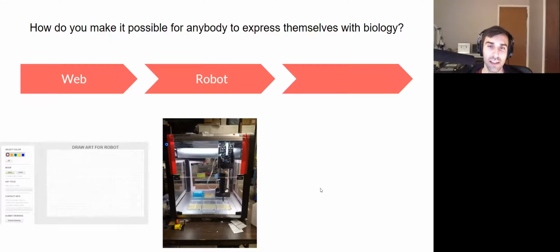This is our Opentrons. It's an Opentrons 2, and we've been going back and forth. The 10 microliter pipette is just a little more precise. But basically, I'll hit play here, and you can see how it works. We have all our colors up here. These are cultures, liquid cultures that are growing. And then the robot goes, and it picks up some of that liquid culture, and it just touches every single point in these square agar plates. And what happens there is it basically just inoculates a colony in that spot. And then after 2 days, a colony will grow.